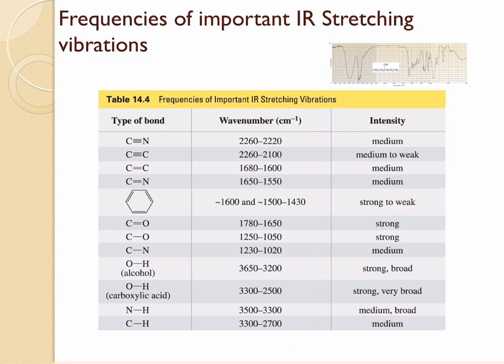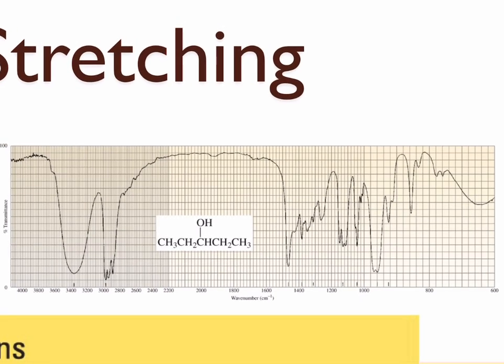When you look into the IR spectrum, there are bands that vary in their intensity. So the nature of the bands that are obtained in an IR spectrum would definitely be useful in identifying the functional group in the molecule. Now let's take a look into this IR spectrum. You can see that there are some bands which go all the way to the bottom, and there are some bands which are lying in the middle of the spectrum, and there are some bands which are actually on the top of the spectrum close to the 100% transmittance.